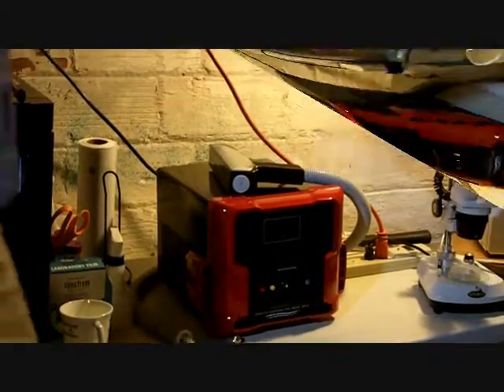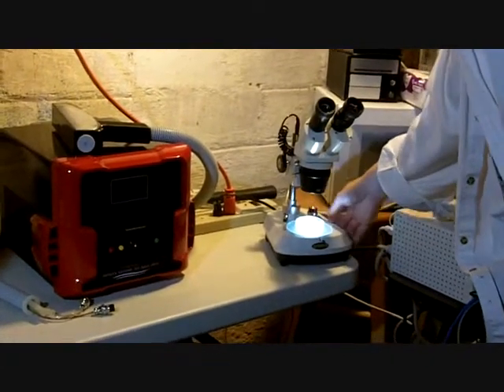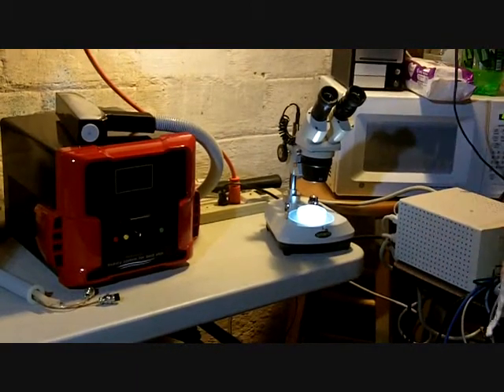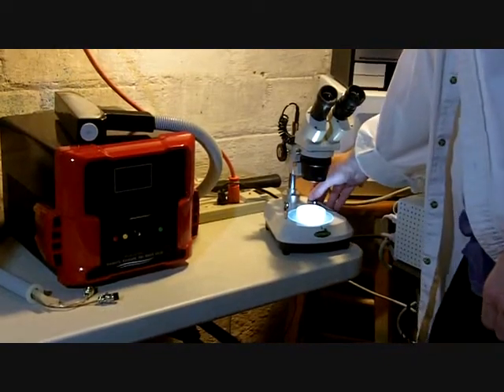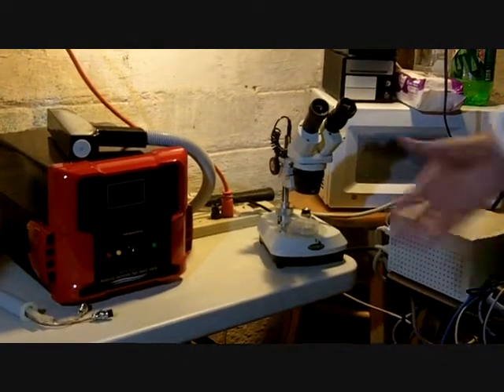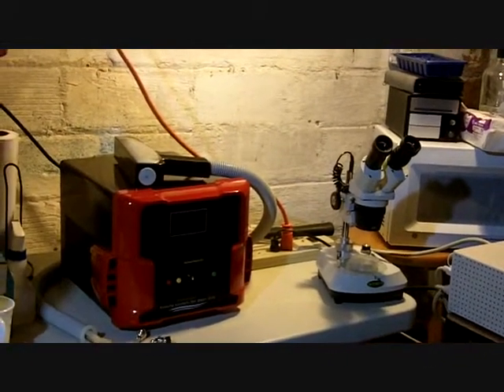And here we have a microscope, so you can take a look at some of the worms as they're growing, after they've gone through their treatments. That's how I transfer the worms from point A to point B, from plate to plate. We use this scope all the time. It's an essential component of worm maintenance, basically. For now, to look at what we've done, that's what we're using. I'm planning on getting a better scope so we can actually image the effects of what we've done and catalog those things.